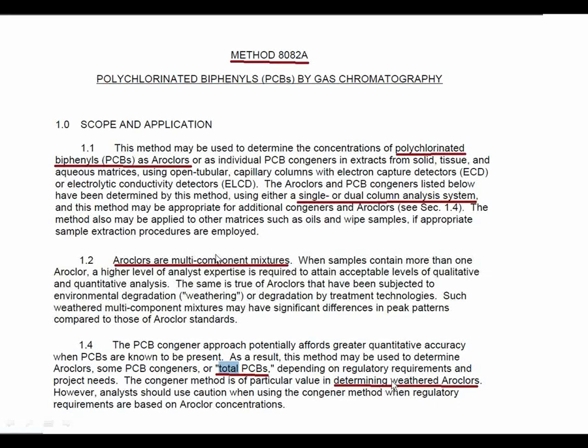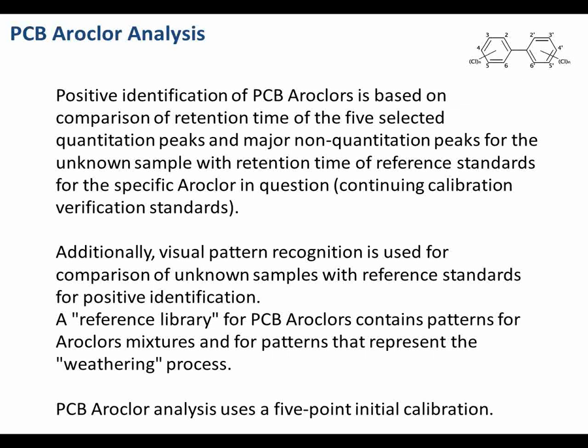Aroclors. The technique which is used is to identify a PCB Aroclor based on the comparison of retention time of 5 selected quantitation peaks and the visual pattern recognition of comparing that to a reference library of PCB Aroclors. Typically, Aroclors have a 5-point initial calibration.